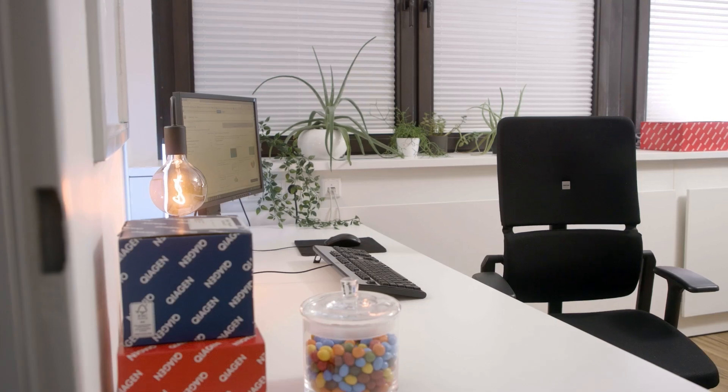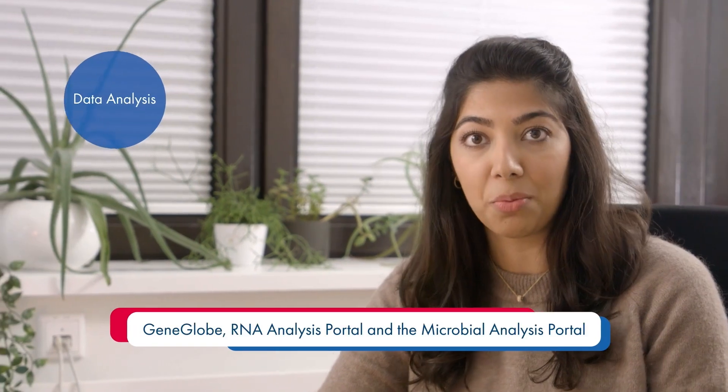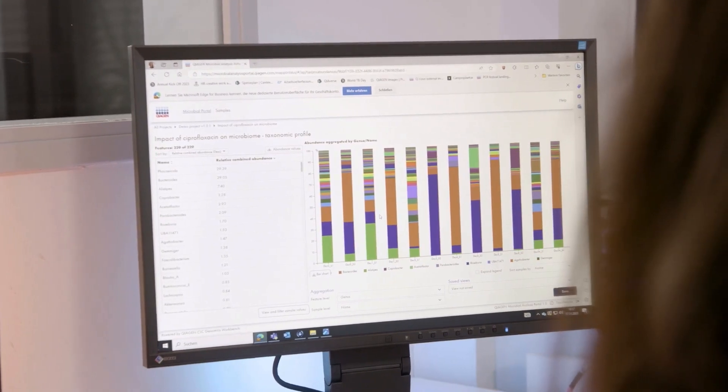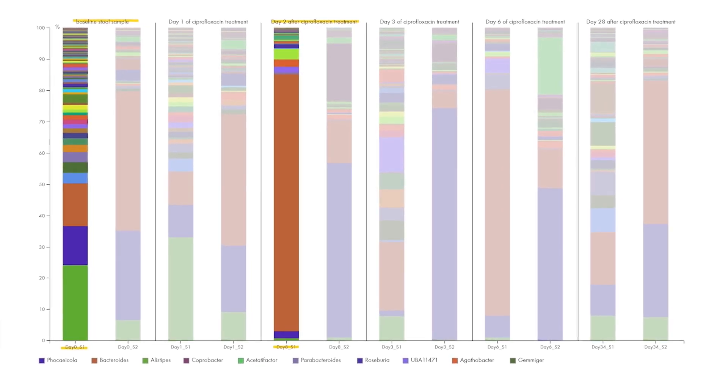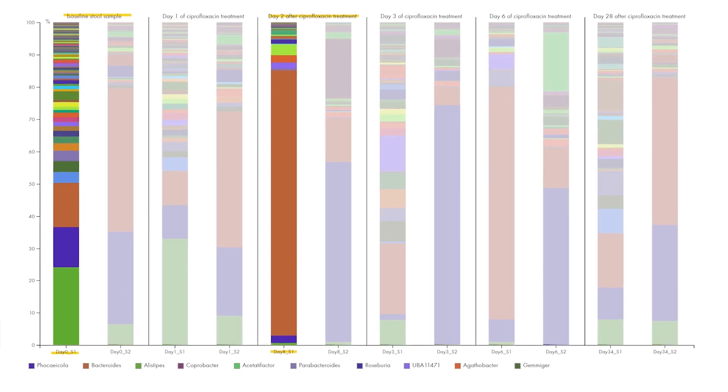Checking in with Sanjana's microbiome project for the final step — data analysis. QIAGEN offers several intuitive, easy-to-use bioinformatic solutions such as GeneGlobe, the RNA Analysis Portal, and the Microbial Analysis Portal. Using the Microbial Analysis Portal to analyze the samples: in the graph, each color represents a different bacterial species. The sample before antibiotic treatment has many more colors, representing much higher microbial diversity compared to the sample after antibiotic treatment — and the ratio of bacteria has also changed — highlighting the impact antibiotics have on the gut microbiome.